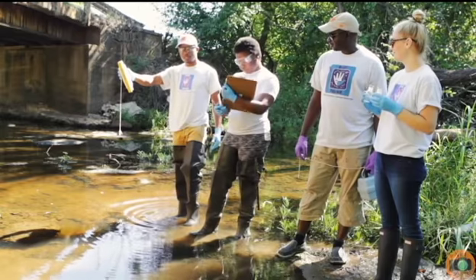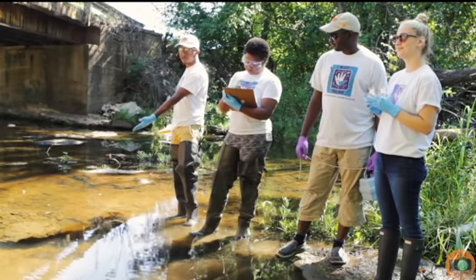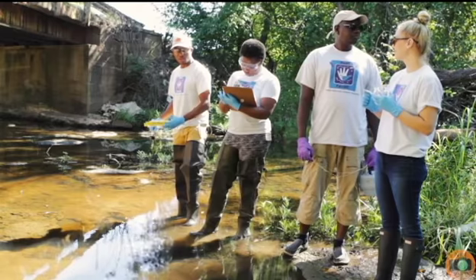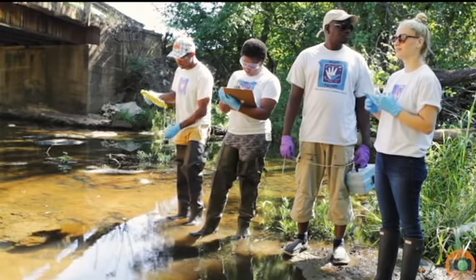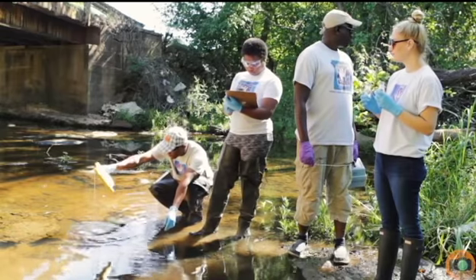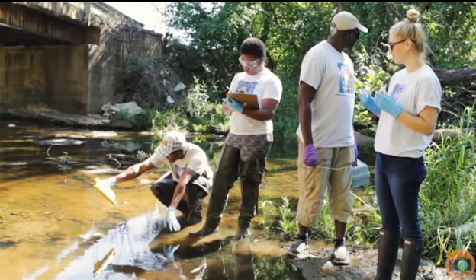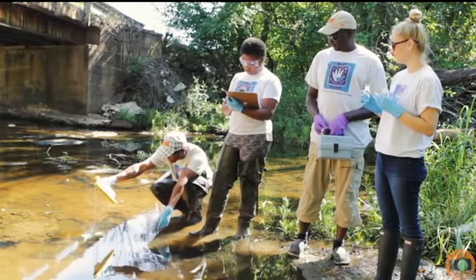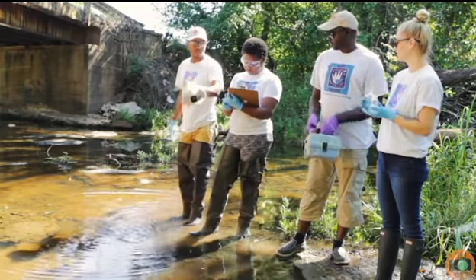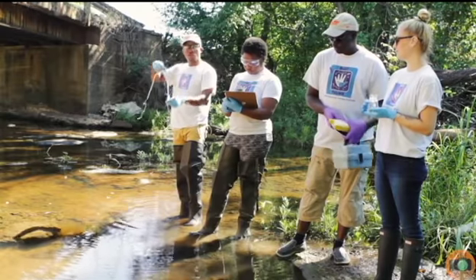We use it to measure the transparency of the stream, and we look out for this point because number one, this point is the deepest part of the stream. At this point we are, and then it's slightly above the riffle, so you don't want to take it where you have a lot of disturbance in the stream, and so this point is the best place for us to do our water quality monitoring. And so you gently dip down the Secchi disc into the stream, and normally you want to make sure that the Secchi disc completely disappears, and then you can take the reading, but this is really good transparency water at this point, and so the reading is 2.2 meters.